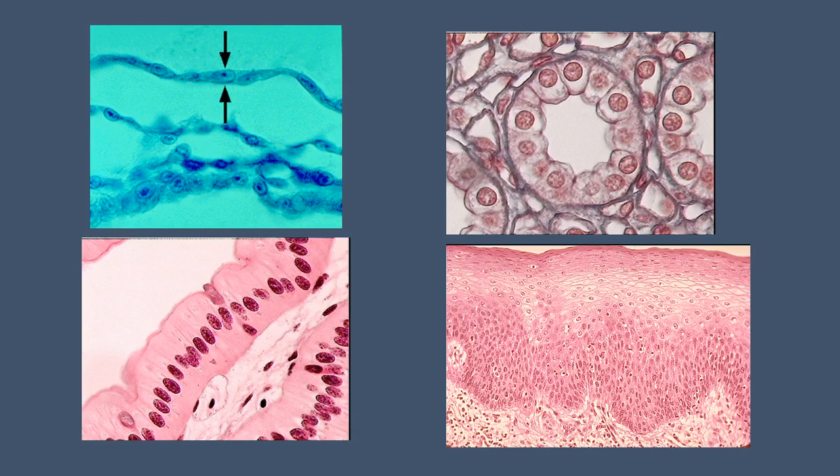And this is showing various examples of the epithelial cells, where you have a single layer of cells here. Here you can see the free surface, all of these have a free surface on them. This is what I was telling you, these look like columnar cells, how they look like long columns. And then certainly here you have multiple layers, so it would be stratified.